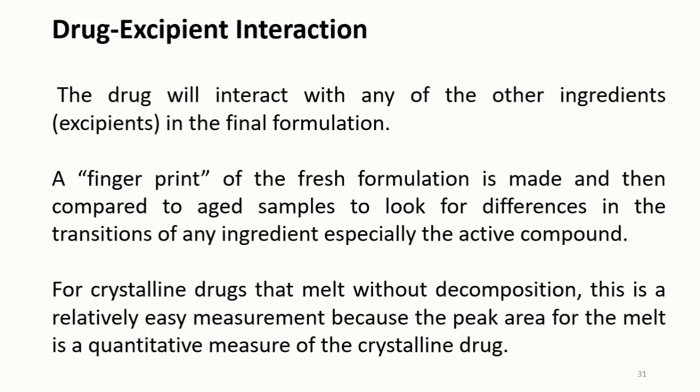This is often a very tedious task where multiple samples must be stored under different conditions for long periods of time and tested regularly with a variety of analytical techniques.